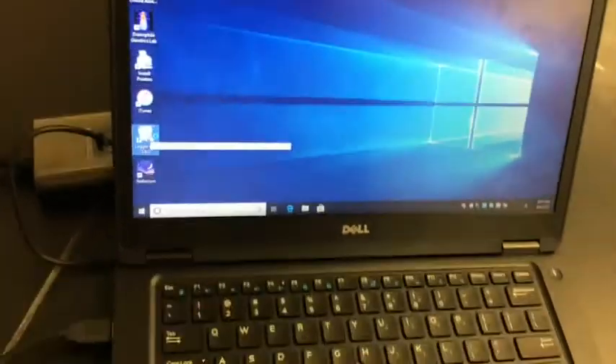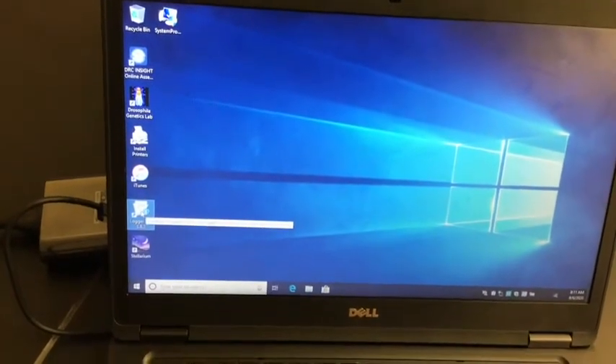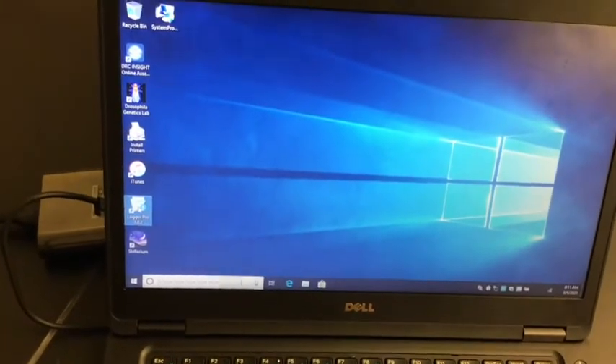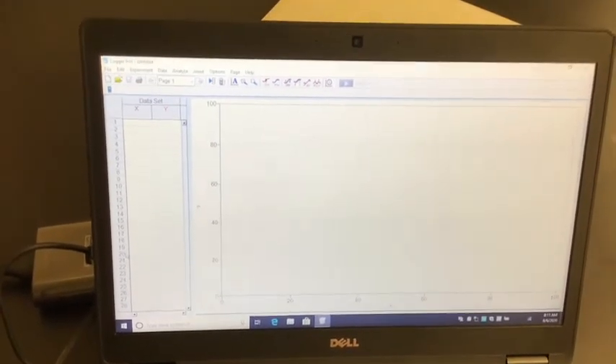Now what we're going to do is set up the program. On the desktop of these computers you should see the application called Logger Pro. Open it up and it should bring you to the Logger Pro interface.